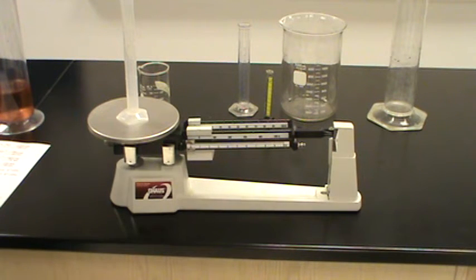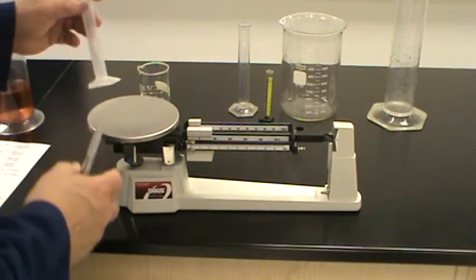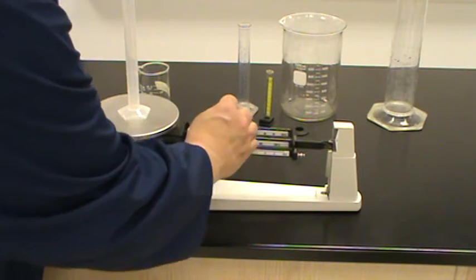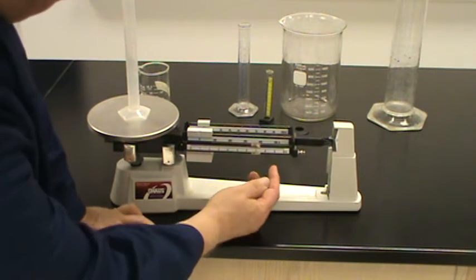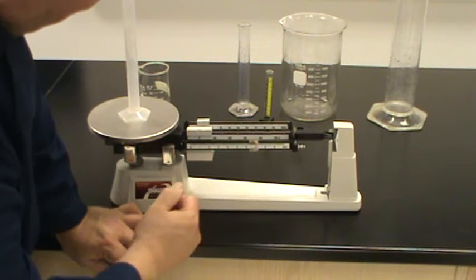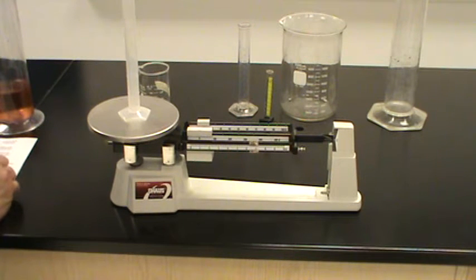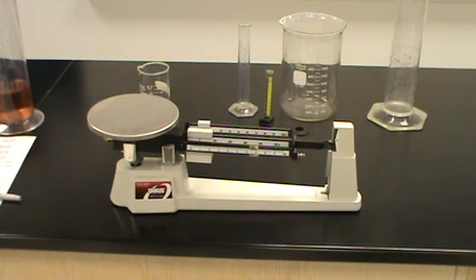So, I want you to take our plastic graduated cylinder, and I want you to weigh it empty. Now, we've already done this several times. Let me make sure and get all the water out. Okay, so gently we're going to set that down. We've done this before. We know that this graduated cylinder comes in at approximately 16.8 grams. 16.8, and that is lining up just beautifully. Next, I ask you to measure precisely 10 milliliters of water.